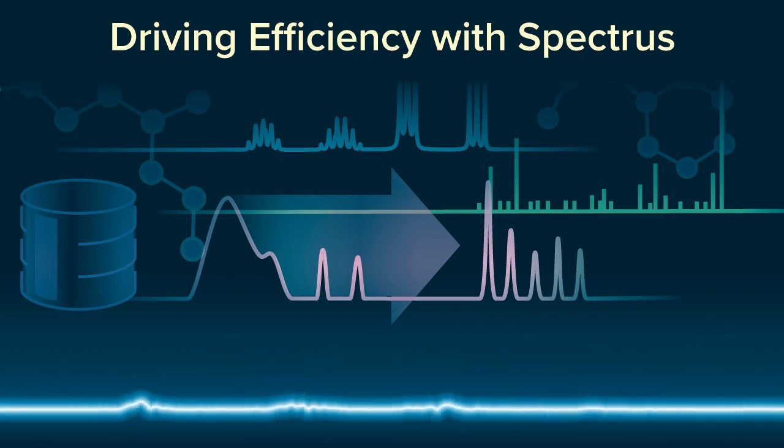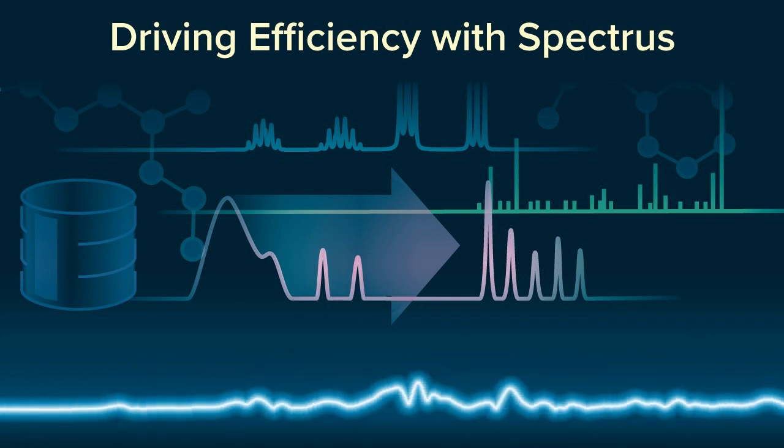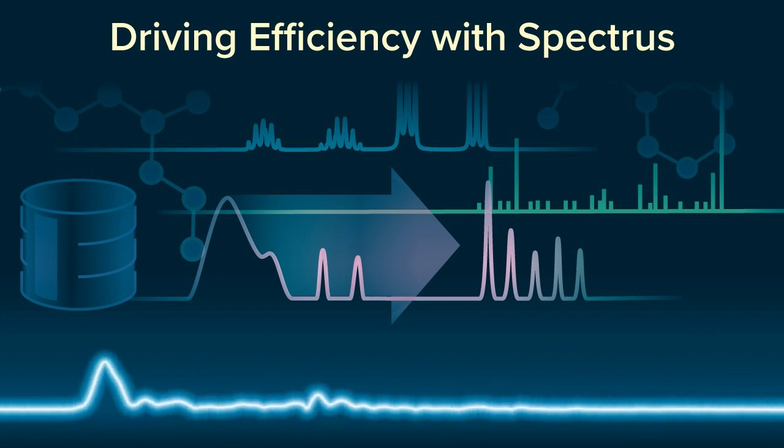By modeling various versions of the method, he was able to reduce the runtime and improve resolution, while also minimizing the number of practical experiments conducted. So what that indicated is actually the method is robust and has good repeatability, and we're able to develop using the in silico modeling software.